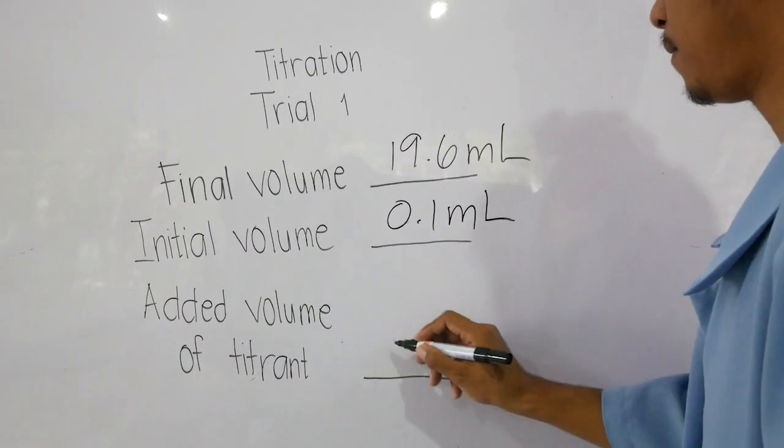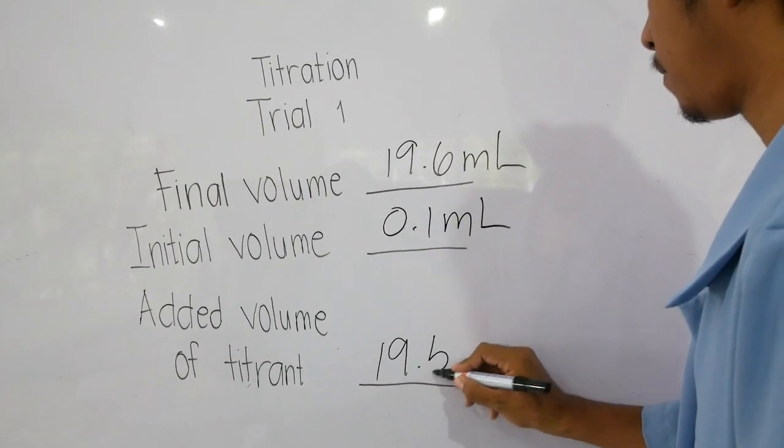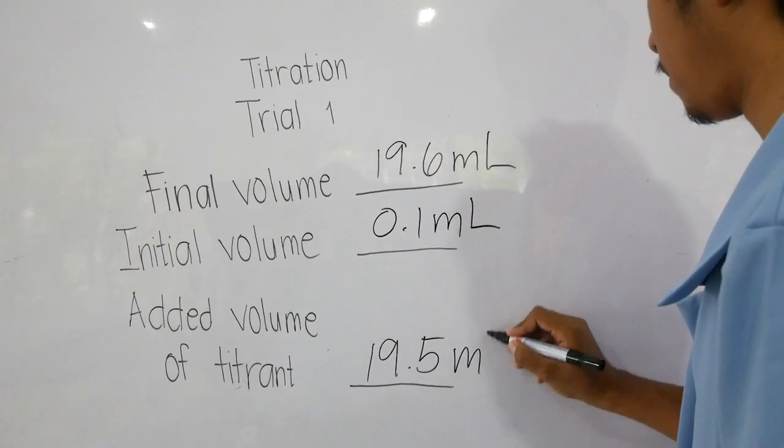Get the difference between the initial and the final volumes to find the total volume of titrant added to the analyte.